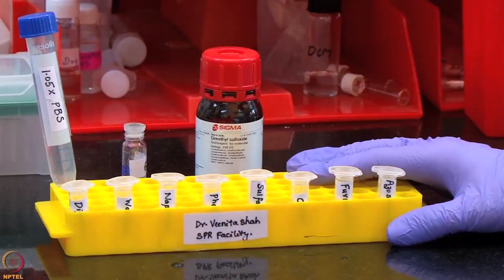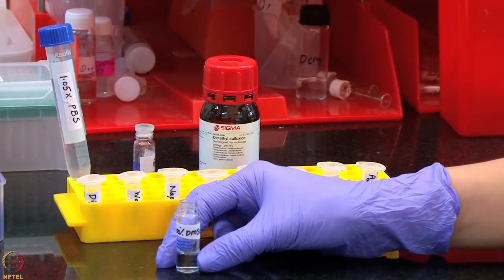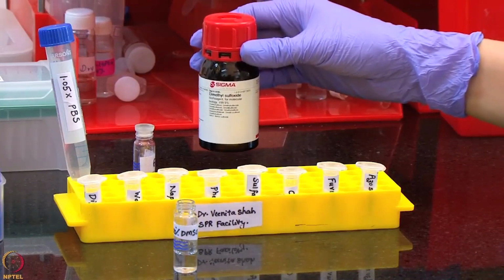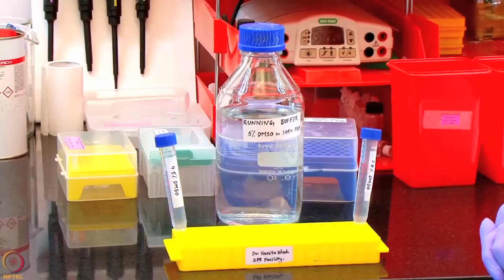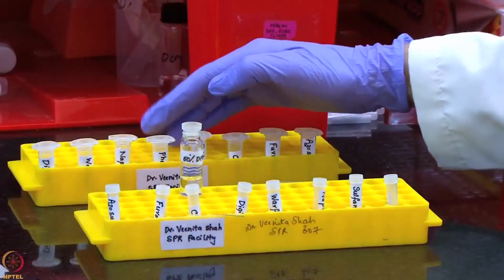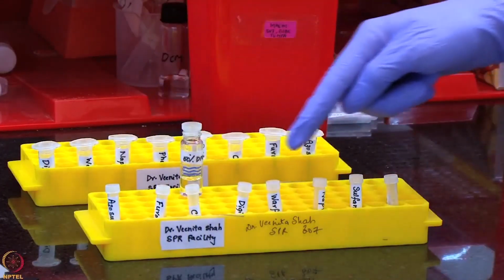So a final concentration of 30 micromolar of small molecules will be used for this screening assay. For washing, we have also prepared 50% DMSO in water using 600 microliter of DMSO and 600 microliter of water in a 16 mm vial. Run-in buffer will also be used as negative control in this experiment. All of these samples and reagents have now been allocated in the required volume in these specialized tubes.